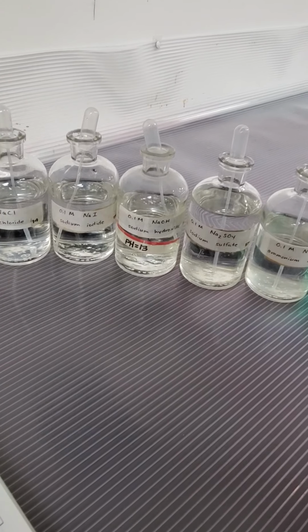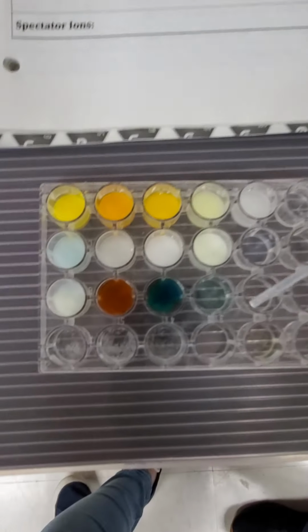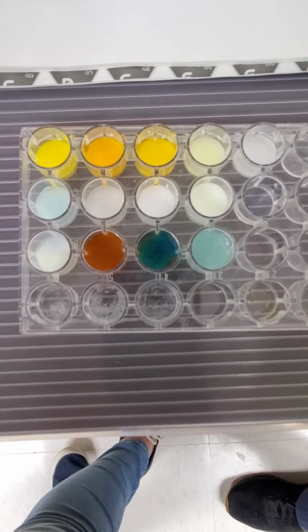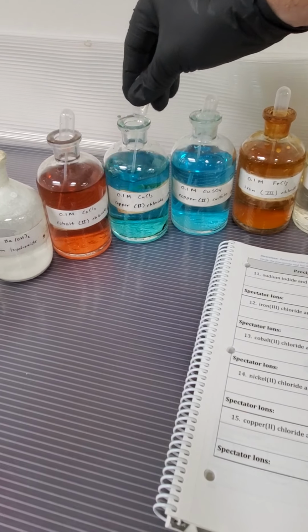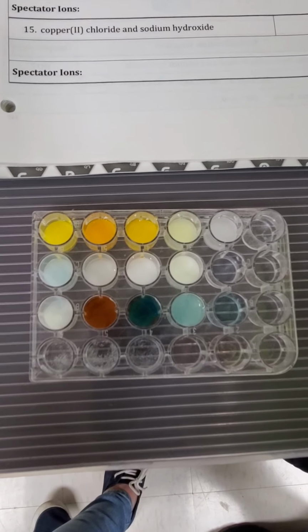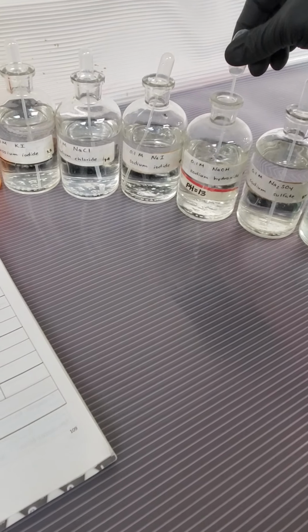And sodium hydroxide. Lastly, copper 2 chloride. And finally, sodium hydroxide.